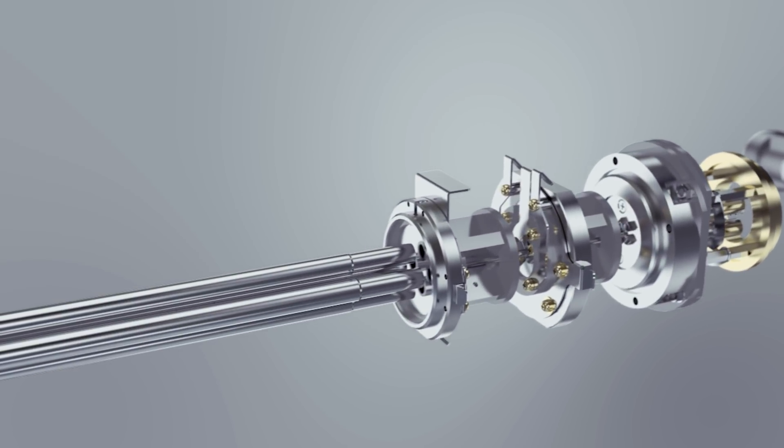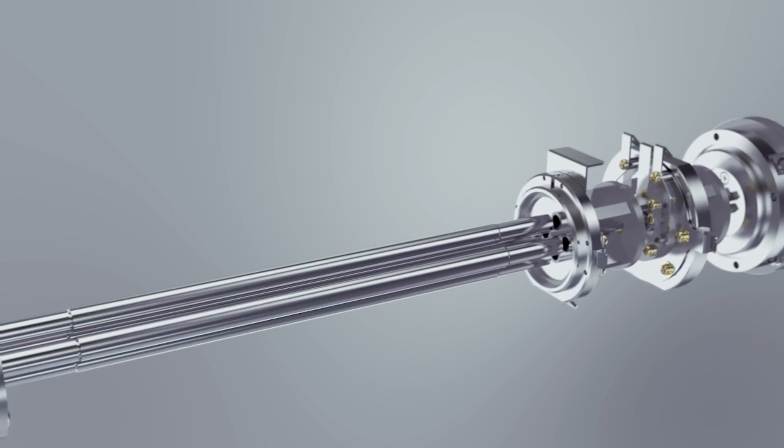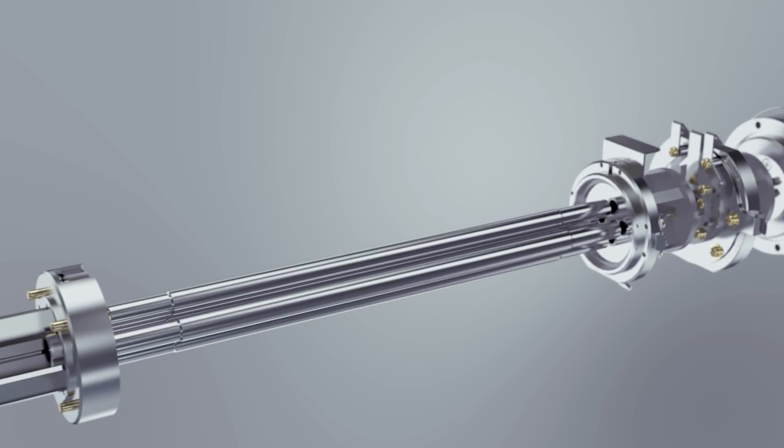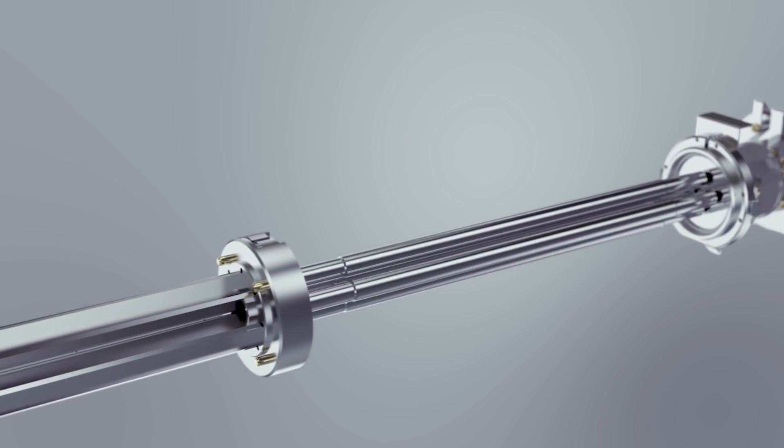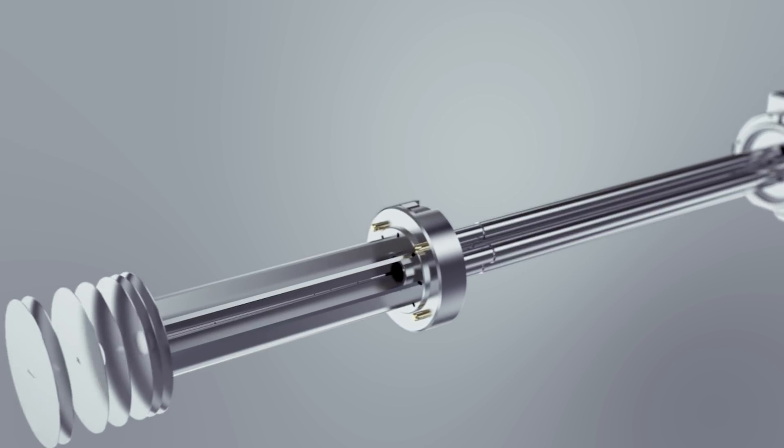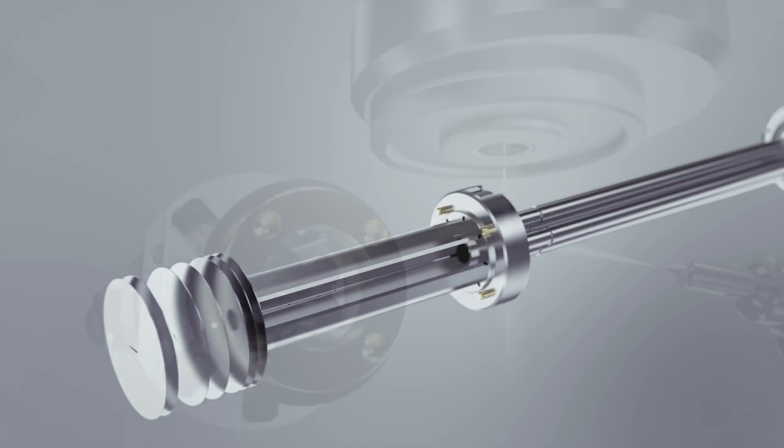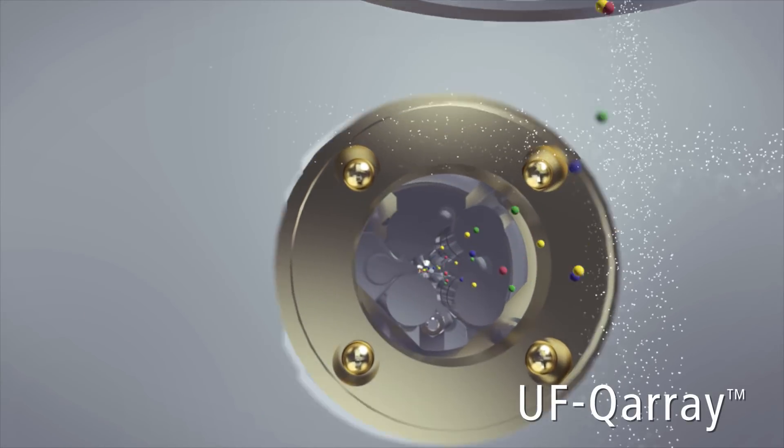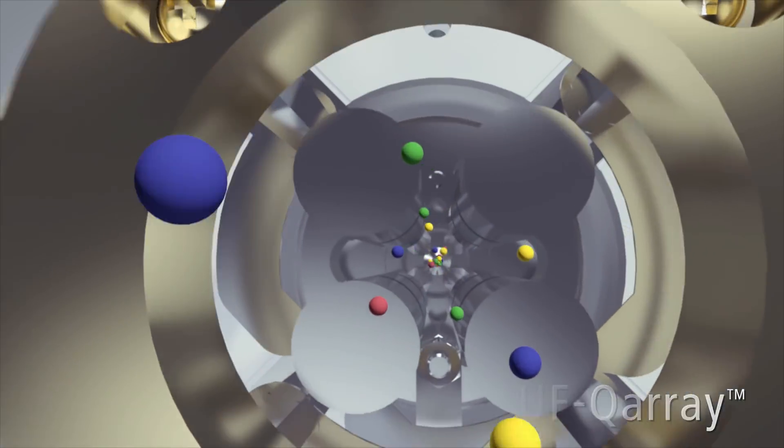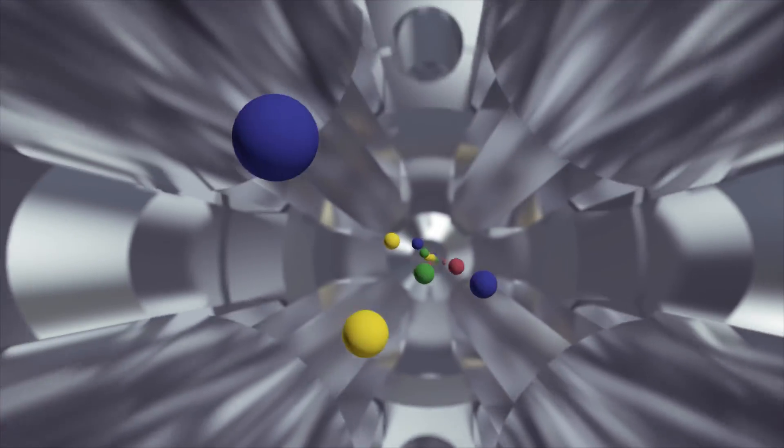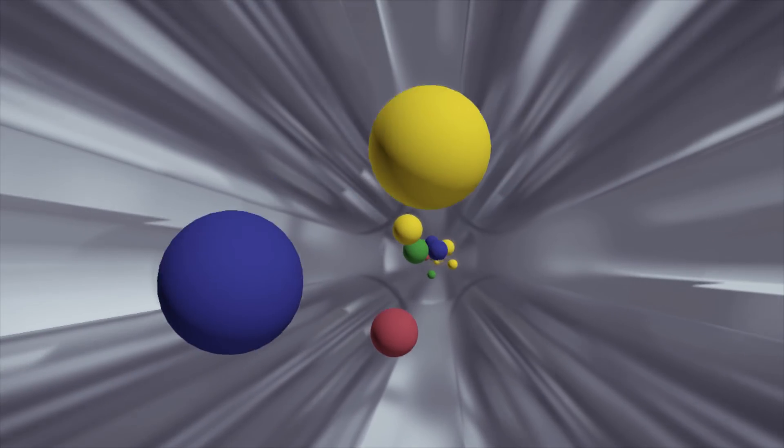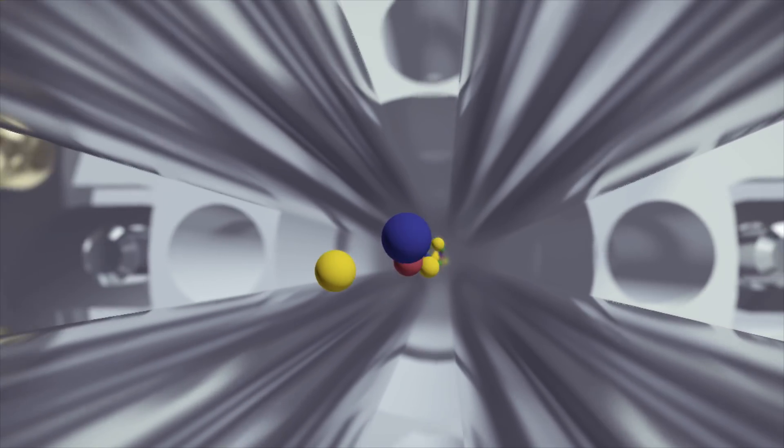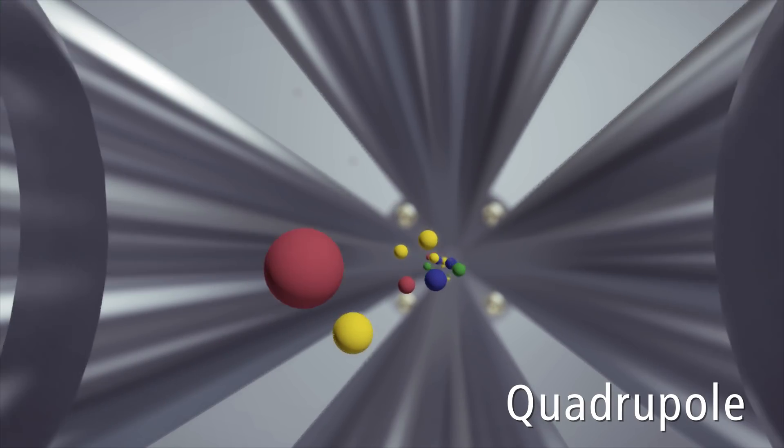The LC-MS 9030 builds on Shimazu's key technologies used in the world's fastest and highest sensitivity triple quadrupole mass spectrometer: the UF-Q array and true hyperbolic quadrupoles.